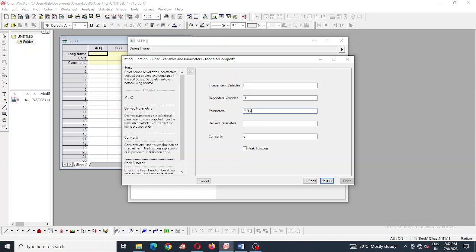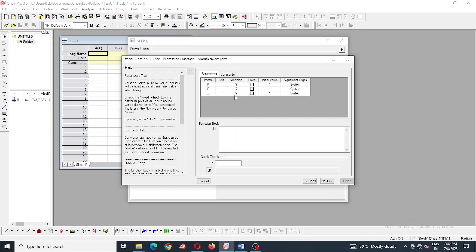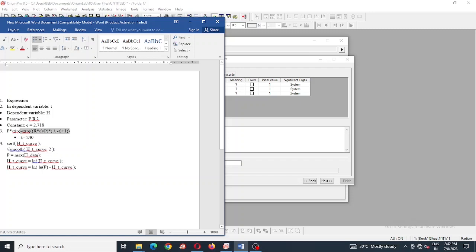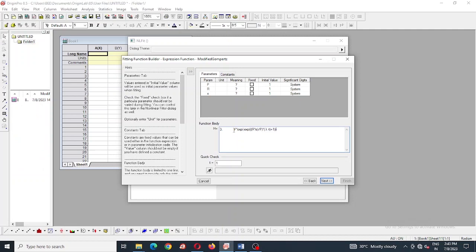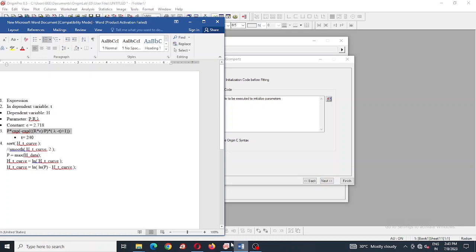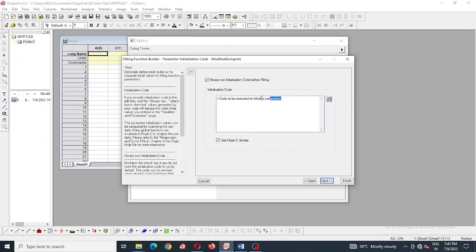Then click next button and put the equation here. Next, what is the fermentation time, we have to add it here - it may be 120 hour or 240 hour. Then click the run button, if it comes one then it's okay, your equation is okay.